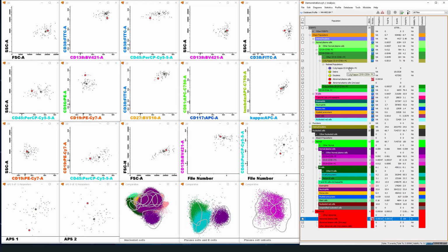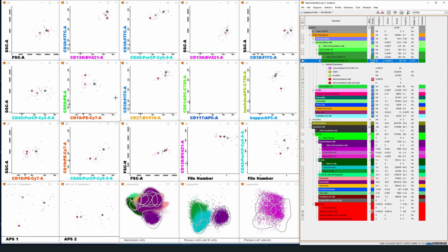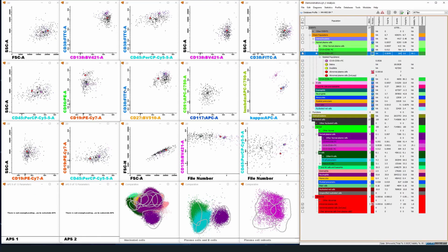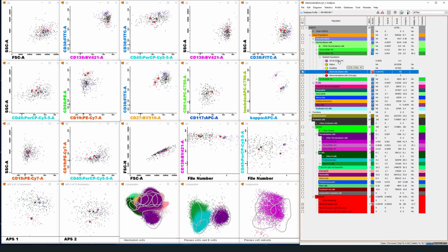So the rest of them may be kappa CD56 plus, and we have a counterpart of CD56 plus lambda cells as well. It appears as if some of them have a bit of CD19, but we'll see in context if that's a problem or not. And of course, among the first tube cells that do not have kappa and lambda, we also see a CD56 bright population, which also seems to be CD45 dim, CD38 dim, CD27 dim, and appears to be at least exhibiting some CD117 expression. So I'll assign them to abnormal for now, and the rest would go to normal.